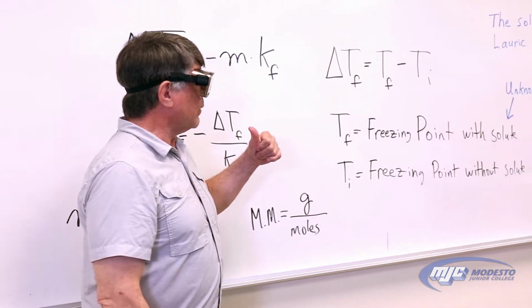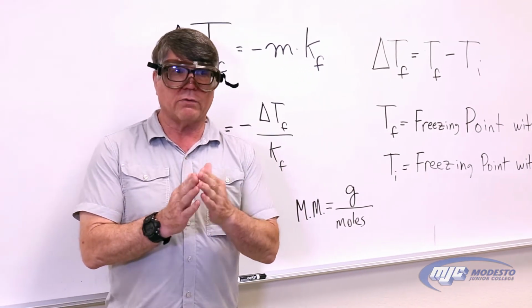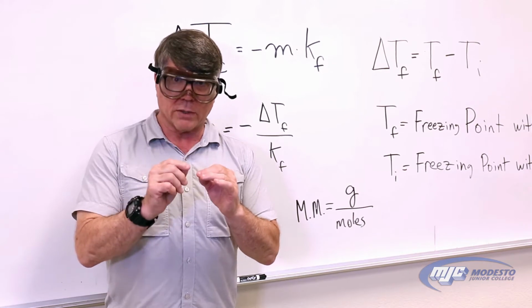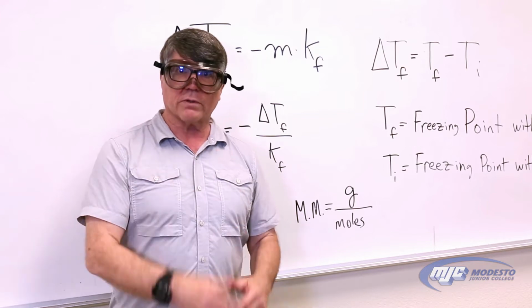So remember, sometimes people forget this or get confused. The solute is the unknown. The solvent is the lauric acid. And so let's go over and get started doing the experiment.